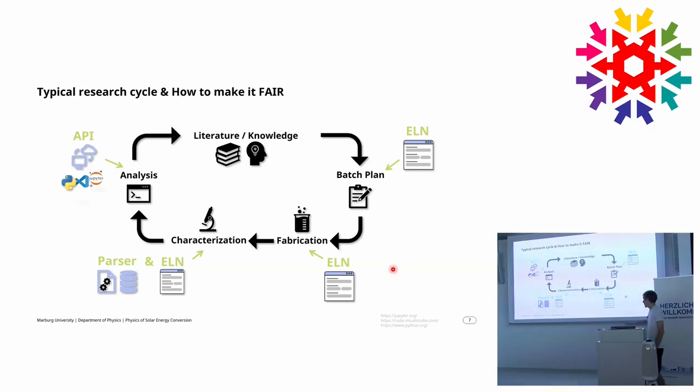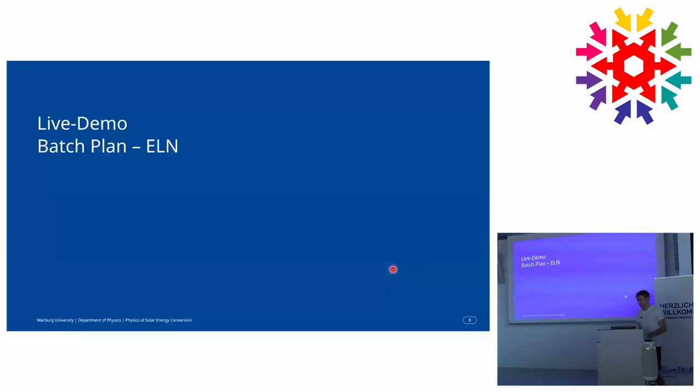Okay, so you see that in all of these steps of the research cycle, an ELN hopefully makes things easier, and you get more out of your data. Of course, sometimes things might sound a little bit more complicated, or there are always some tricky things you have to cope with. Okay, then I will go to the browser now to show you some hands-on stuff.